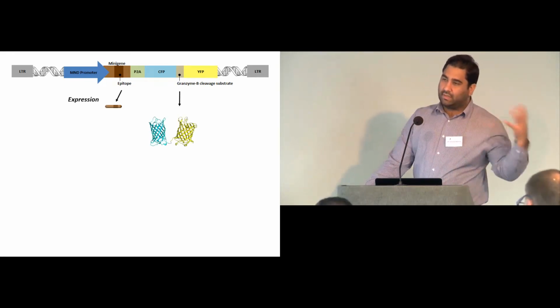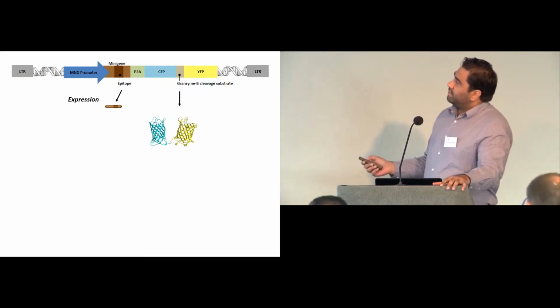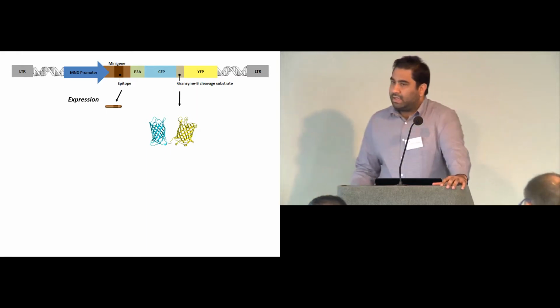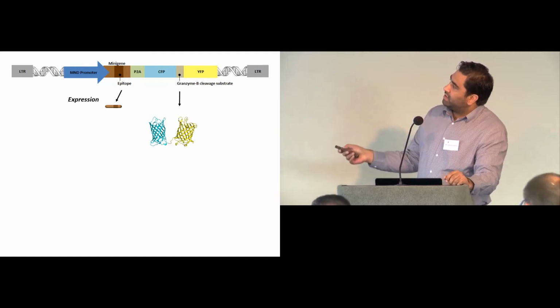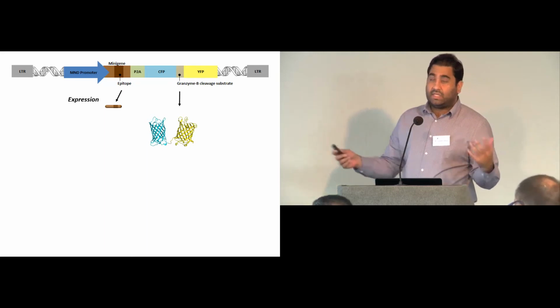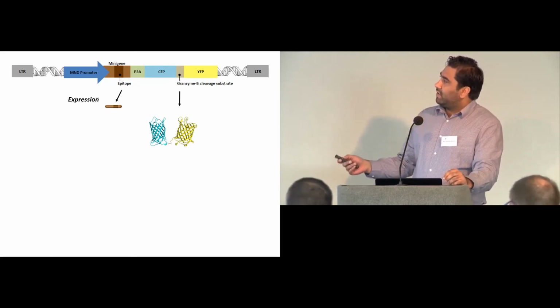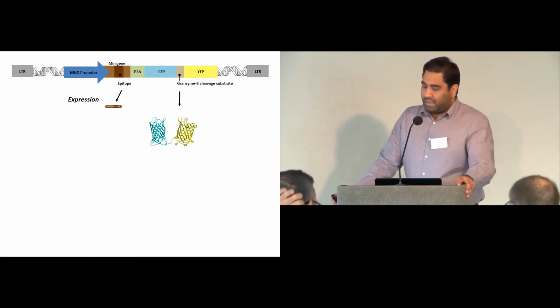And so I constructed this by taking a CFP domain, fusing it to a YFP domain, and in between those two domains, encoding a short granzyme-B cleavable linker substrate. This fusion transgene is also encoded alongside short peptide-coding minigene sequences that can be delivered together as part of this lentiviral cassette into surrogate host target cells. And once inside those surrogate cells, we get independent expression of each component.